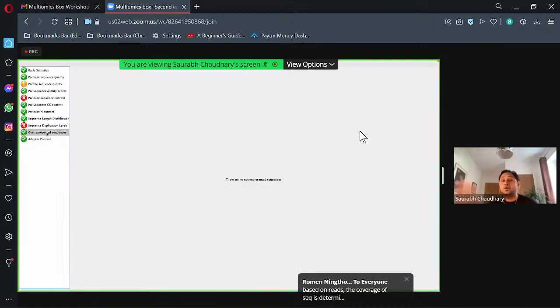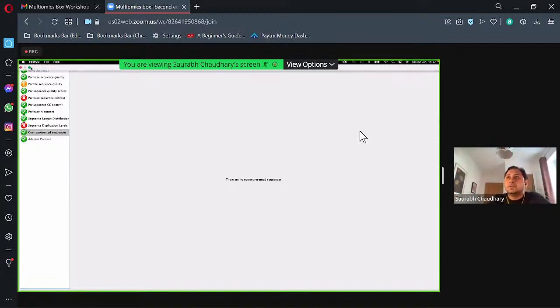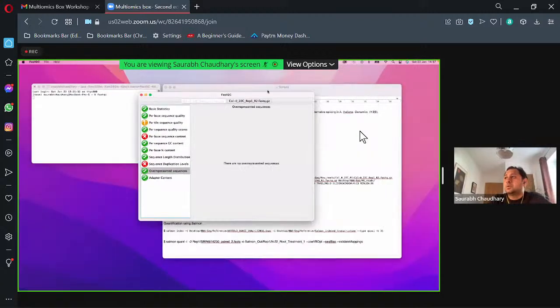So this is an overview of your RNA-seq raw data files or high quality reads data files. This is nothing but just for your confidence level that, oh, my data is good. I can perform the downstream analysis from now. Okay. So there is no must to that. It will tell you about your quality.